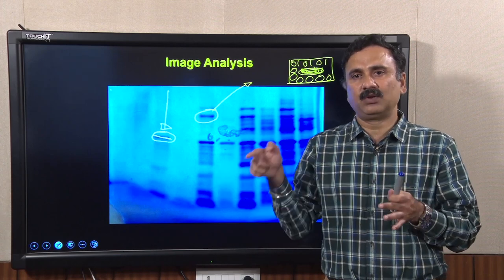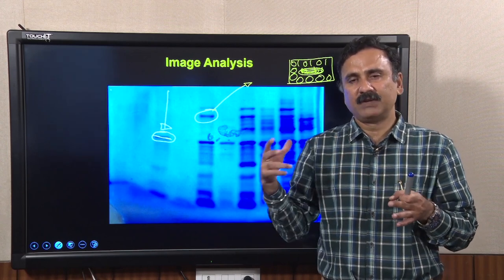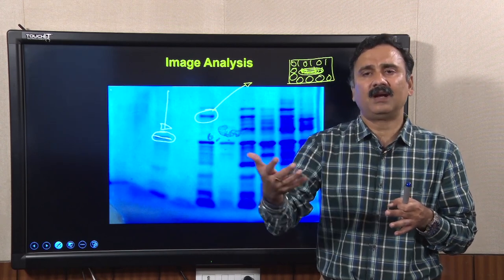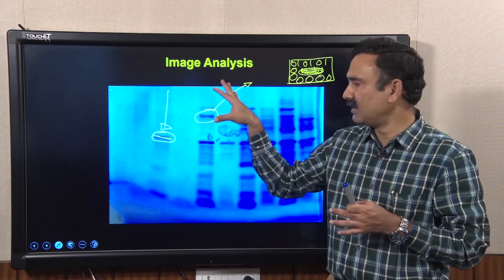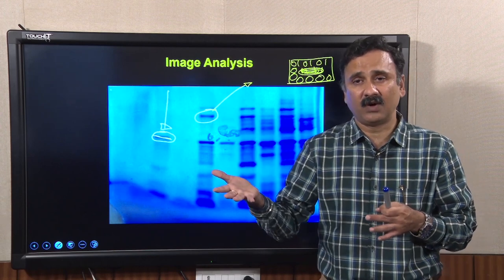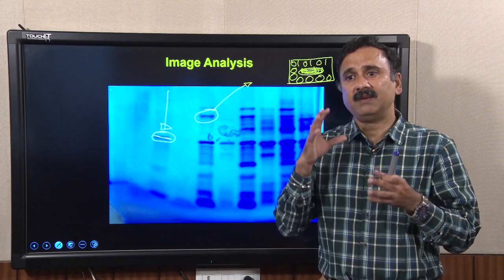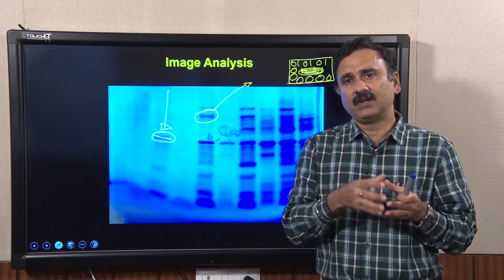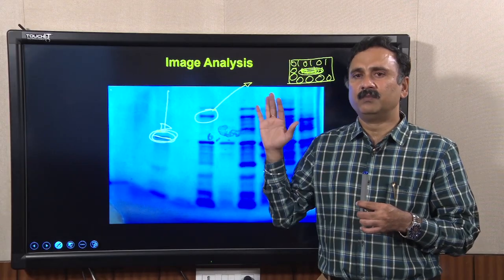If you calibrate the software, it is going to analyze your image and assign a number to a particular intensity, and as a result you can convert this whole image into that format, which helps the software understand each and every pixel present in the image. That is how you can identify the position of this band and measure its intensity. For this purpose we have a couple of software packages which can be used to perform this function.